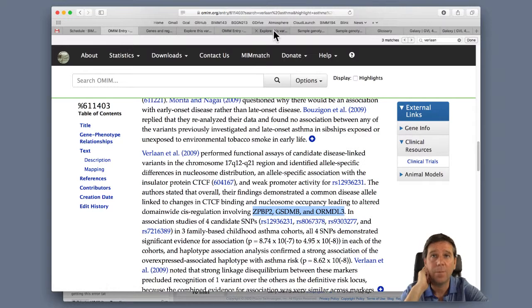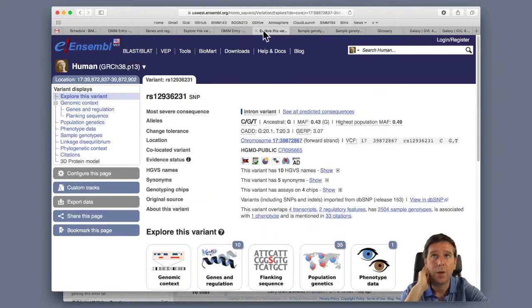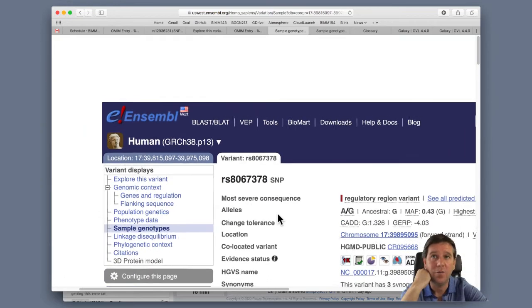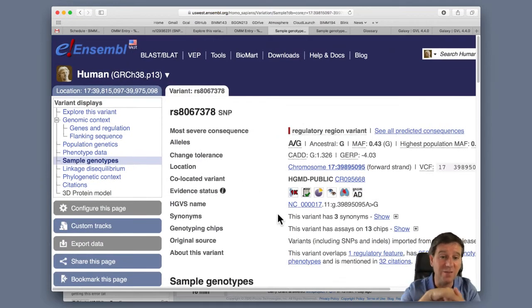That brought up my Genome Browser for this, unlike the first SNP that I clicked on, which was in a gene and probably affects that gene, right? This one was not in a gene. So what could this be doing? I wanted to find out more about this SNP.